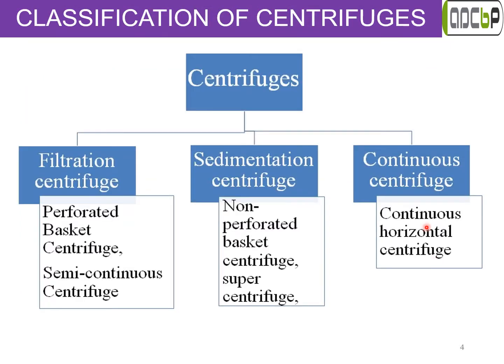Let us discuss the classification of the centrifuges. The centrifuges are classified on the basis of mechanism involved in the separation. There are three types. The first type is called filtration centrifuge. It works on the principle of filtration. For that purpose, it contains a perforated basket as a filtration device inside the centrifuge.